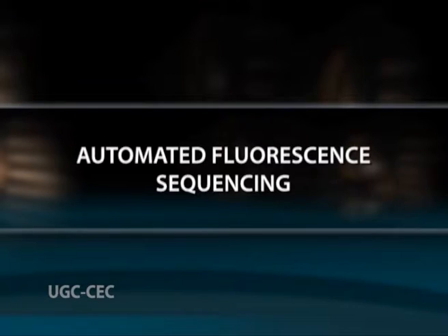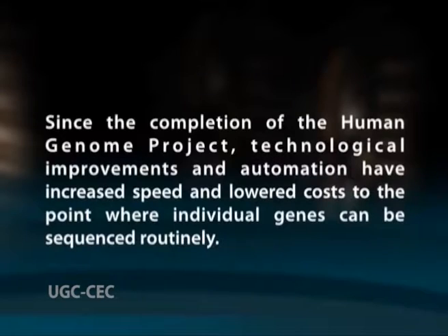Automated fluorescent sequencing. Since the completion of the Human Genome Project, technological improvements and automation have increased speed and lowered cost to the point where individual genes can be sequenced routinely, and well over 100,000 billion bases can be sequenced per year, or an entire genome can be sequenced.